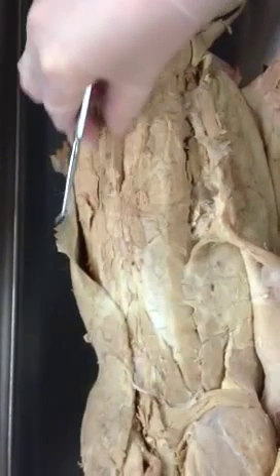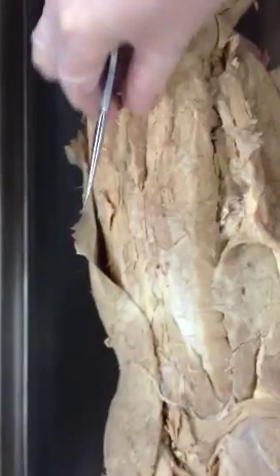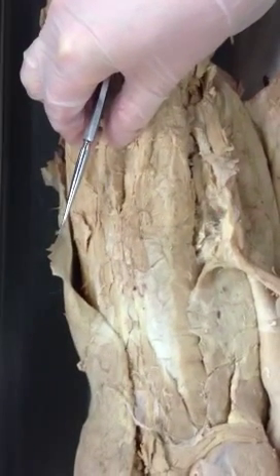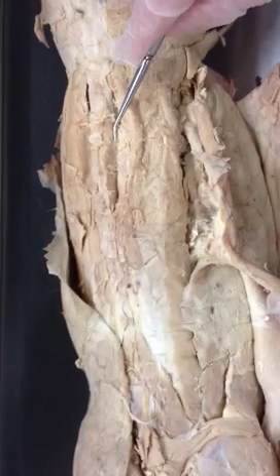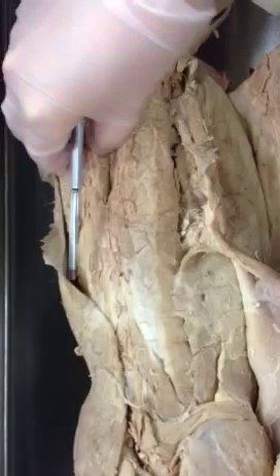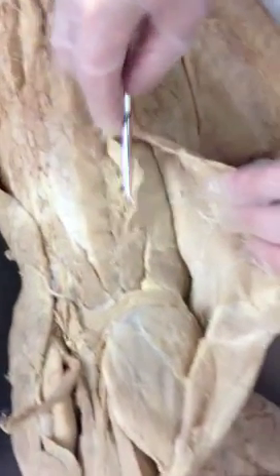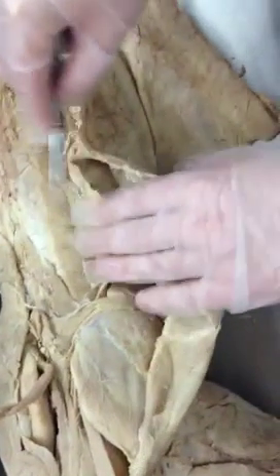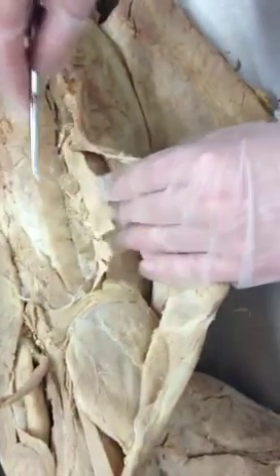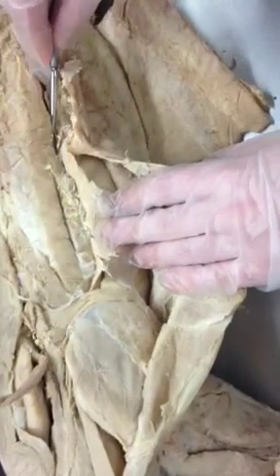Medial to the longissimus dorsi is the multifidus spinae, which is part of what's called the transverso-spinalis group. The multifidus spinae sits right on the vertebrae. There are also two flaps of muscle called the serratus dorsalis. The column furthest from the vertebrae is called the iliocostalis.